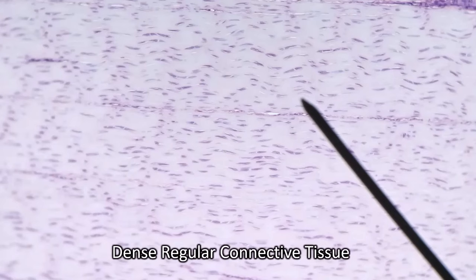Because this is at a lower magnification, maybe you had a hard time figuring out this was dense regular connective tissue. You might have found it harder to decide: are those nuclei of these cells in between the fibers, or are they in the fibers? But you'll also notice you're seeing rows of nuclei lined up like ants, so you have many fibroblasts lined up end to end, and you will not see that pattern in smooth muscle.